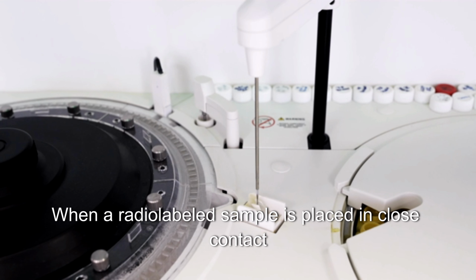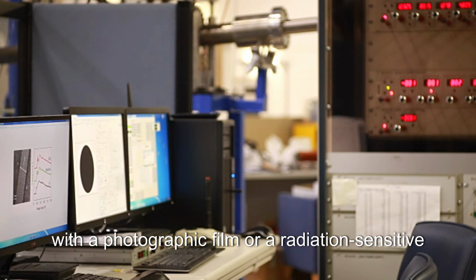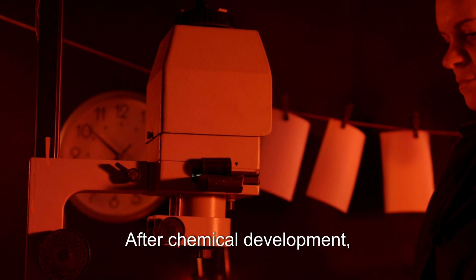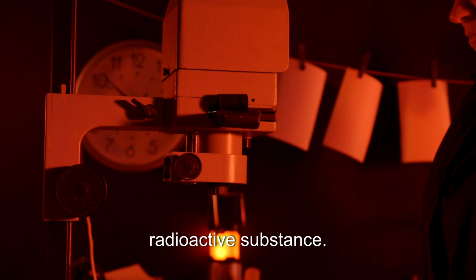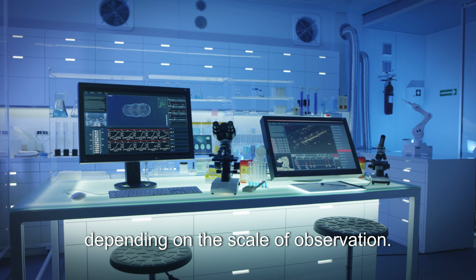When a radio-labeled sample is placed in close contact with a photographic film or a radiation-sensitive detector, the emitted radiation exposes the film. After chemical development, dark regions appear on the film indicating the presence and distribution of the radioactive substance. Autoradiography can be classified into several types depending on the scale of observation.